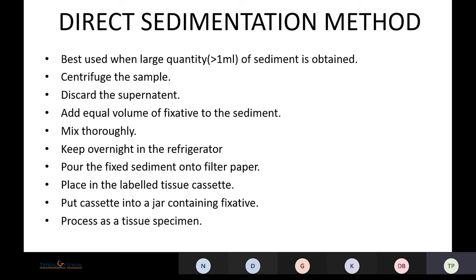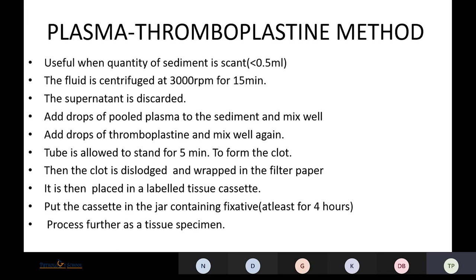Then we pour the sediment onto a filter paper and keep it in a labeled tissue cassette. We put the cassette in a jar containing fixative and process it like a tissue specimen.